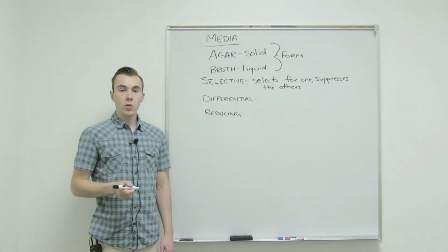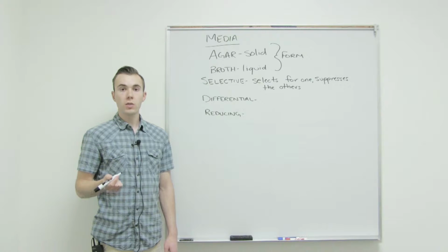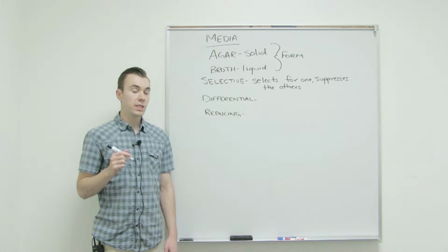Differential media is going to allow us to differentiate, or in other words, see differences. So differential media allows you to see differences, and usually it is by color.